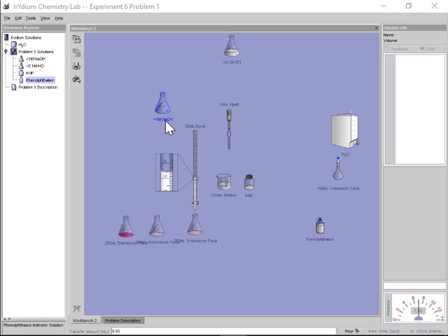So they're close, but again, the whole point of a titration is to be more precise. I would even like to be more precise if I can. Unfortunately, my titrant volume, how much base I dropped in, was somewhat less than 10, and that left me only with 2 sig figs if you account for the error.